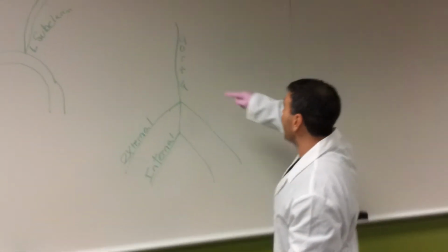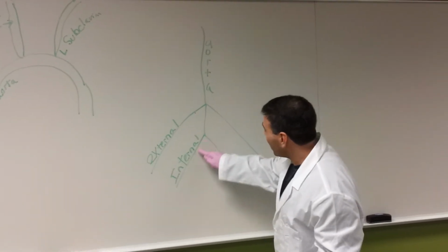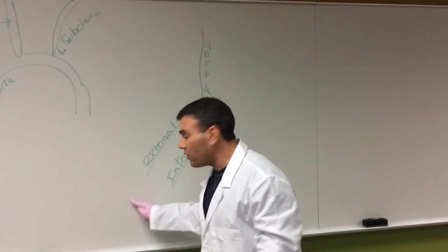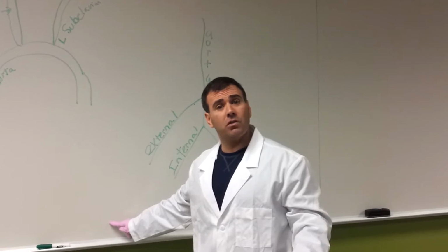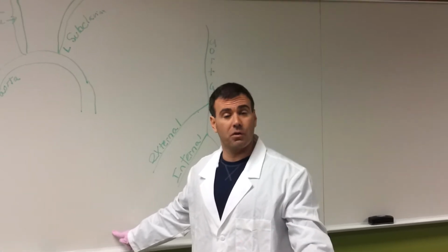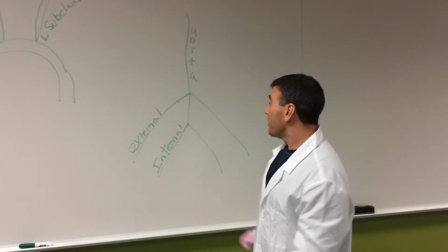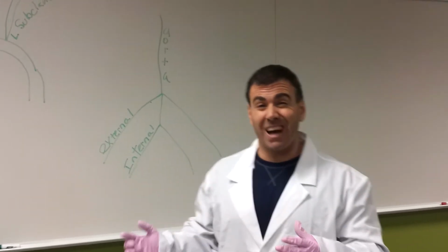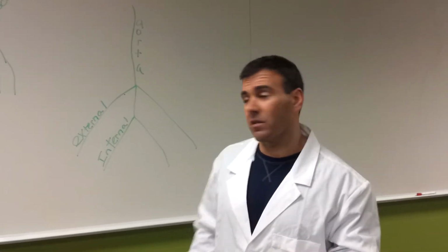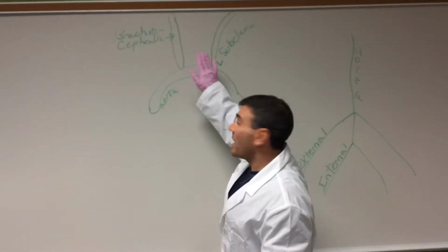So what we've got is that aorta branches into the external, and it has almost like this little tree shape. This external iliac is going to lead down into the rest of the leg. So we're going to go into our external iliac, our femoral, our popliteal, and so forth all the way down our leg. If we go down a little bit, our internal will be going to our pelvis. Again, in humans, we've got that common iliac artery, but we don't have that in cats. So that's the second major difference. External and internal, no common iliac, brachiocephalic and left subclavian.